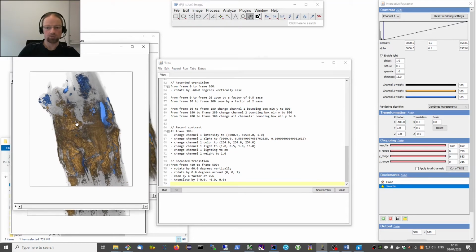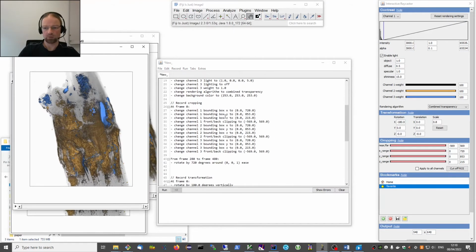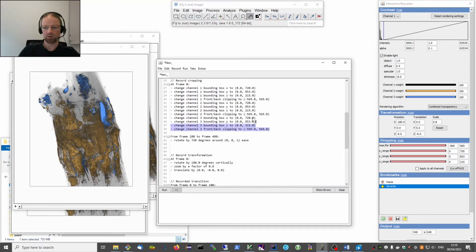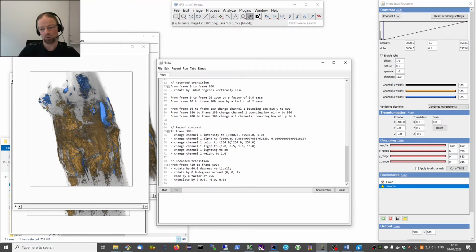That's what I wanted to create with you, and I think you saw quite some details. You also see it got quite long, but most of it is actually these recordings which you don't even need to type. So in the end I think it makes all sense, I hope at least.